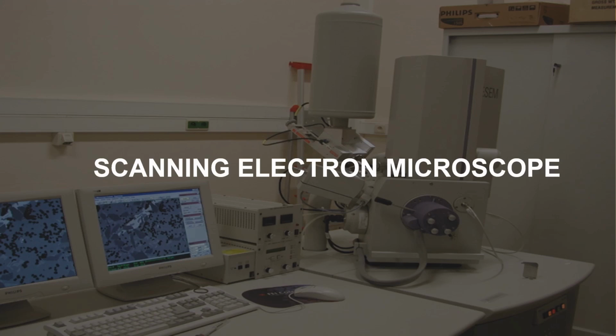Hello everyone. Today we are going to see the scanning electron microscope, or SEM. SEM is a special microscope that uses electrons instead of light to give us a very detailed look at the surfaces of different materials. Imagine looking at tiny particles like grains of sand or cells with such detail that you can see every bump, groove and shape. That's what SEM helps us do. And it's used in many areas, from studying biology to developing new materials.